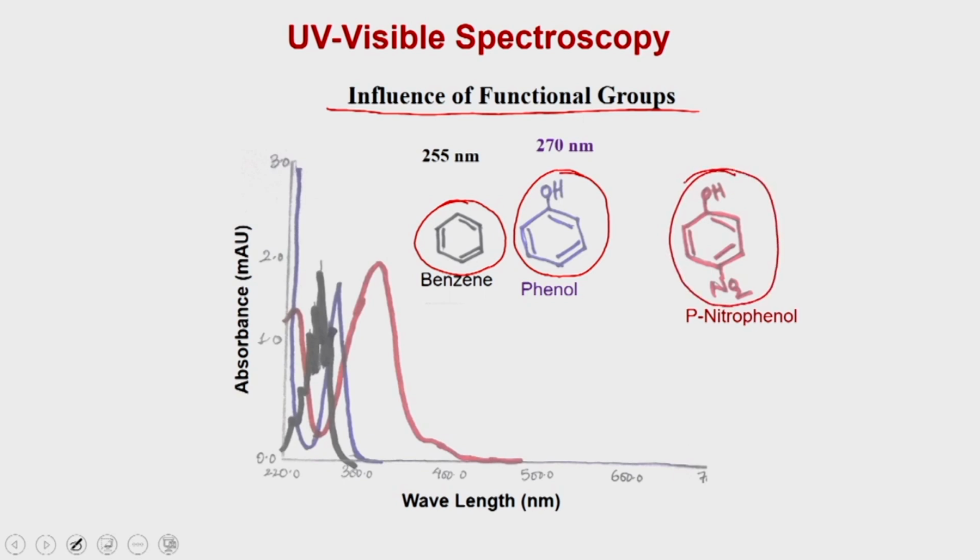If you see the absorption spectra, the black colored spectrum belongs to benzene.